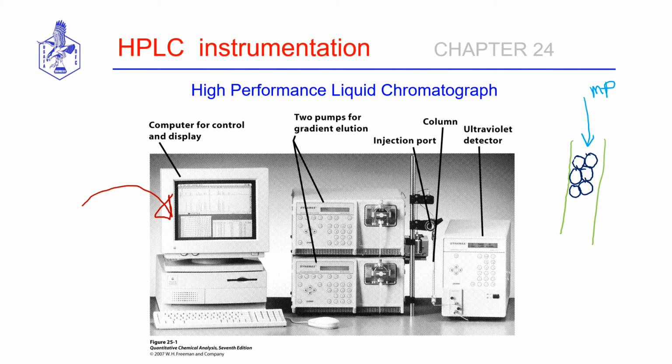So a component in an HPLC is a pump. Oftentimes these are somewhat sophisticated because we're going to have to adjust the pressures that we use, as well as introduce different solvents into our mobile phase. Oftentimes we're not just using a singular component, but a mixture of several solvents. We must then somehow introduce our sample, so we have to have an injection port. That's what's right here in the diagram.